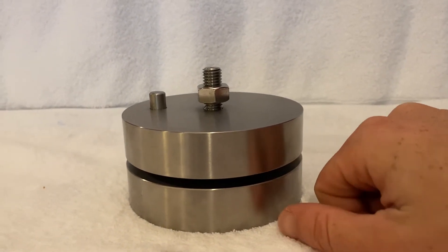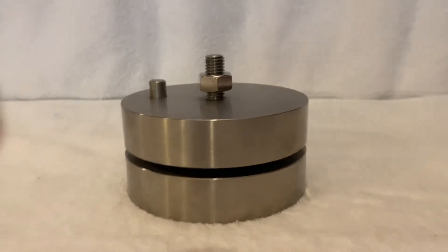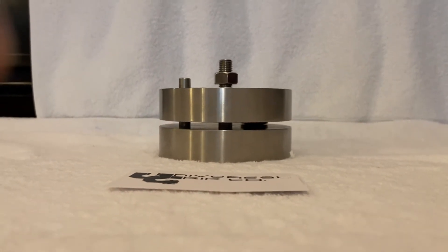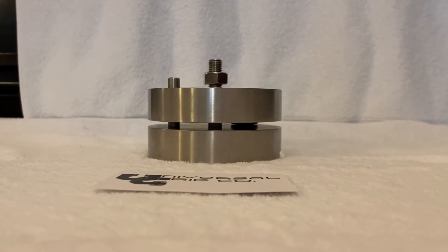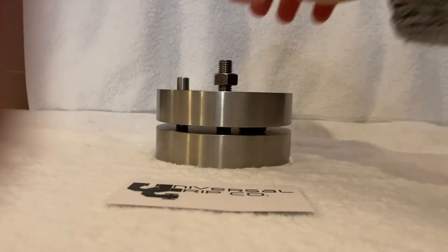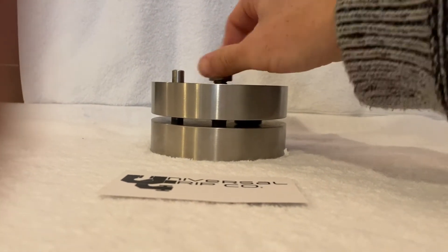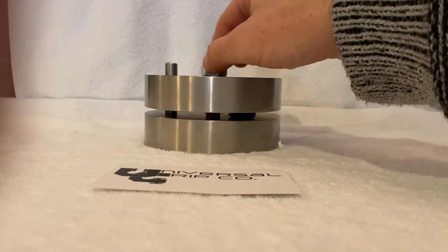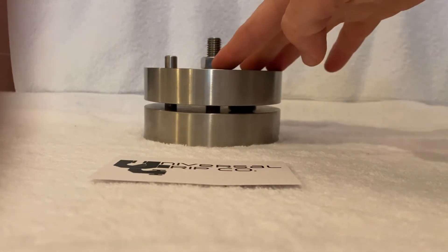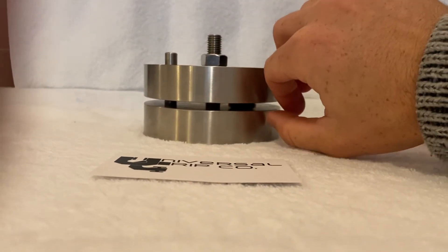The gauge block goes down in between there so you can see the sample resting. You then tighten this screw to the exact location and the spacers will stop it.